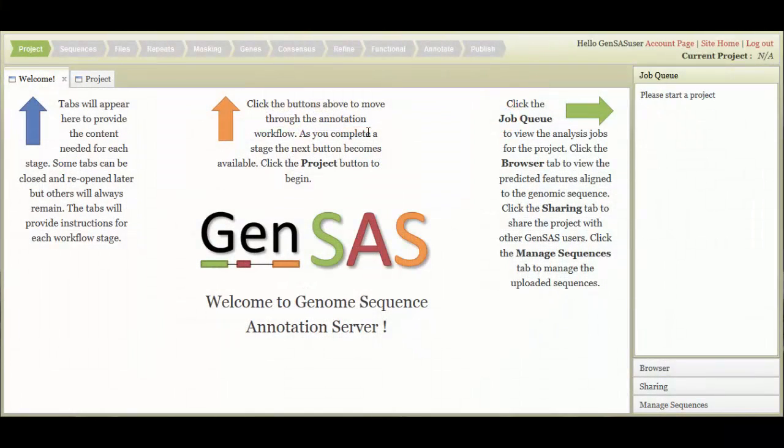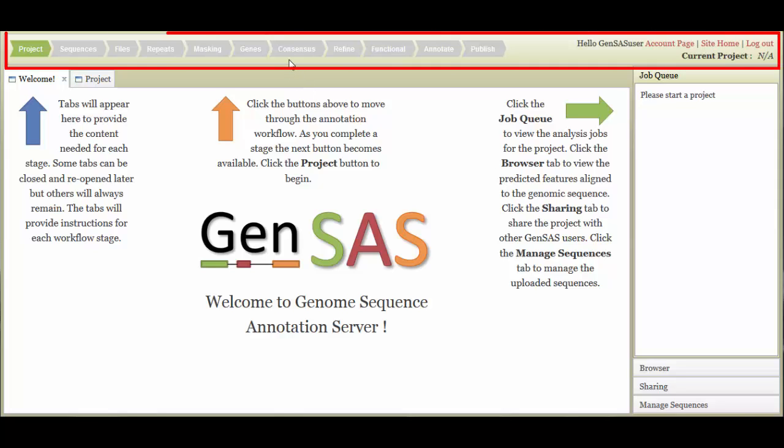There are three main areas of the GenSaaS interface. In the header, there is a flowchart of the annotation process. As you progress through GenSaaS, steps will become available for use. There are also links to your user account, the site homepage, and to log out. The name of the current project is also displayed.